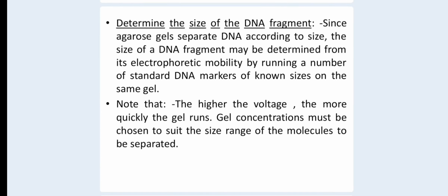Determine the size of DNA fragment. Since agarose gels separate DNA according to size, the size of a DNA fragment may be determined from its electrophoretic mobility by running a number of standard DNA markers of known sizes on the same gel. Note that the higher the voltage, the more quickly the gel runs. Gel concentration must be chosen to suit the size range of the molecules to be separated.